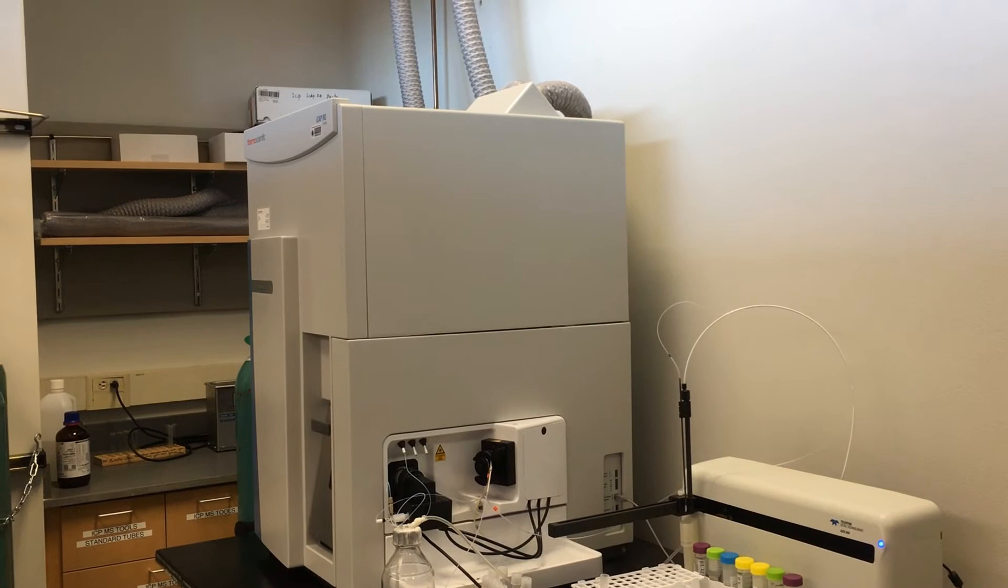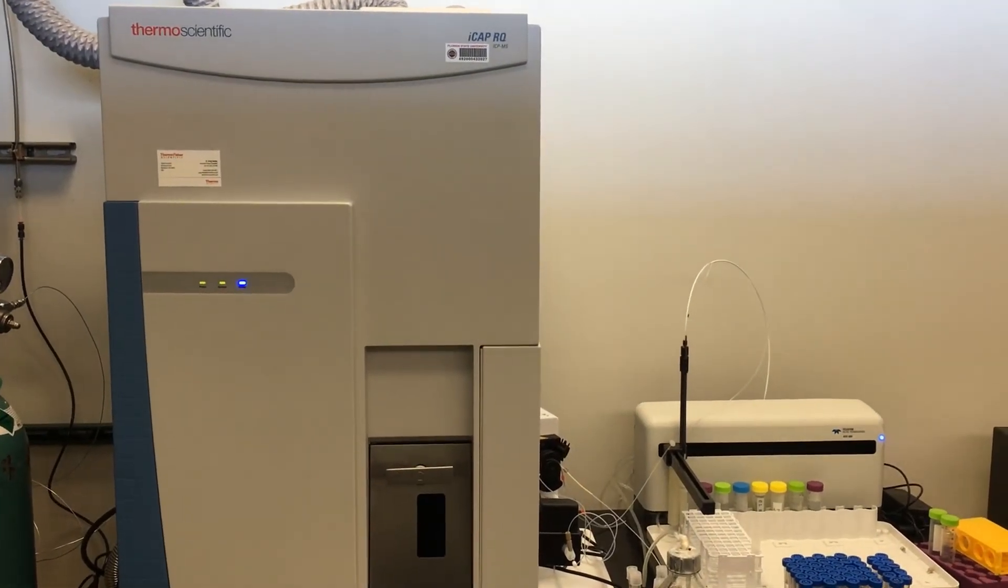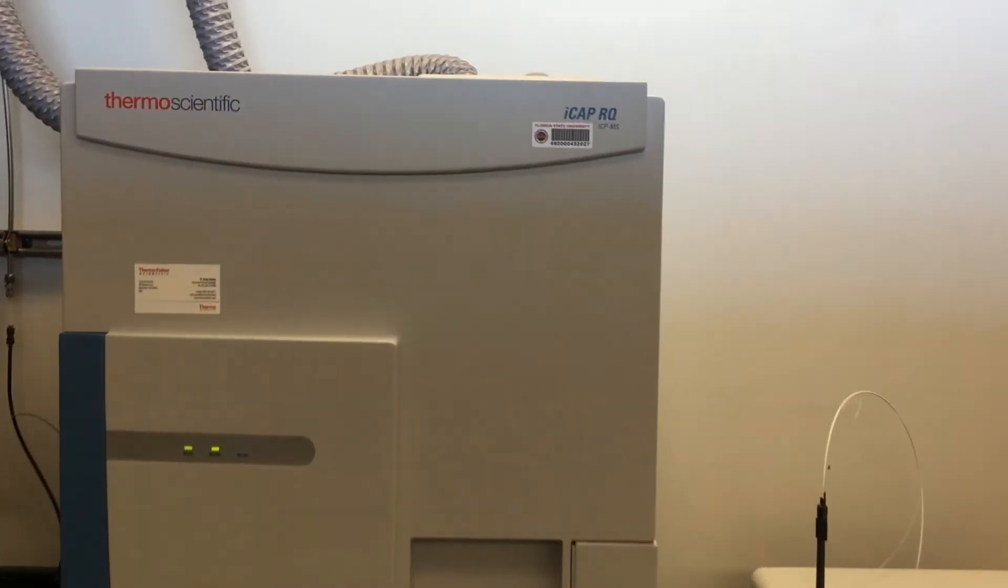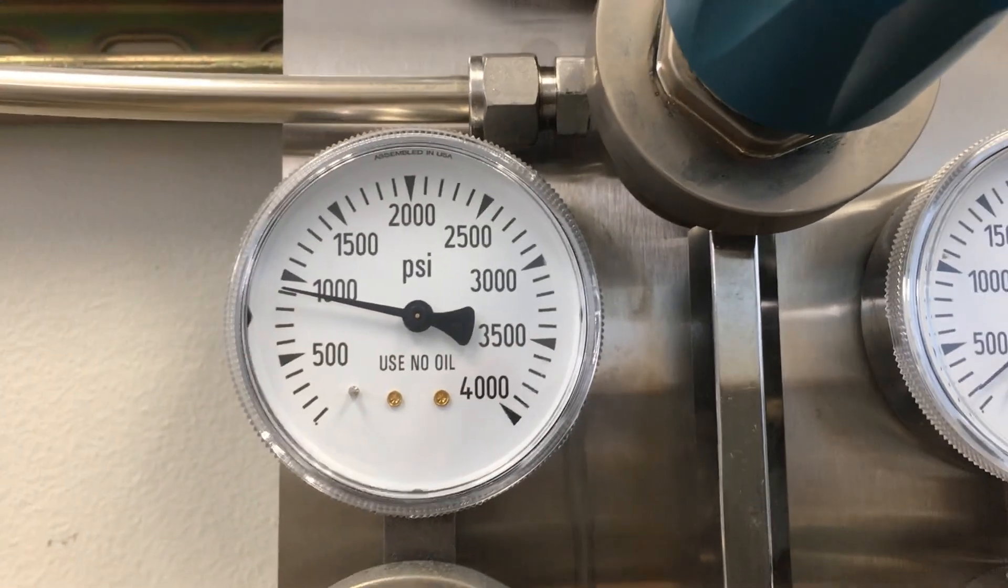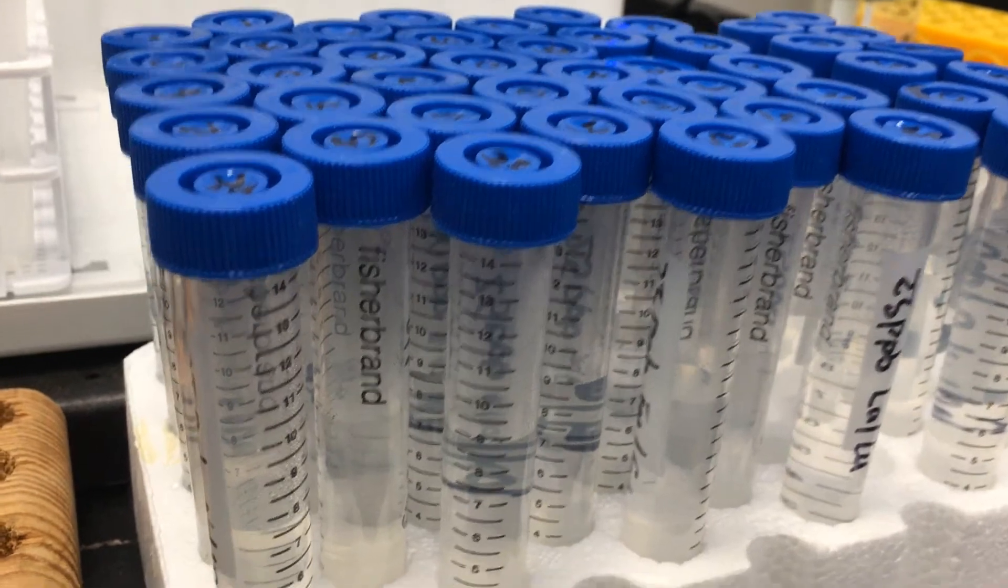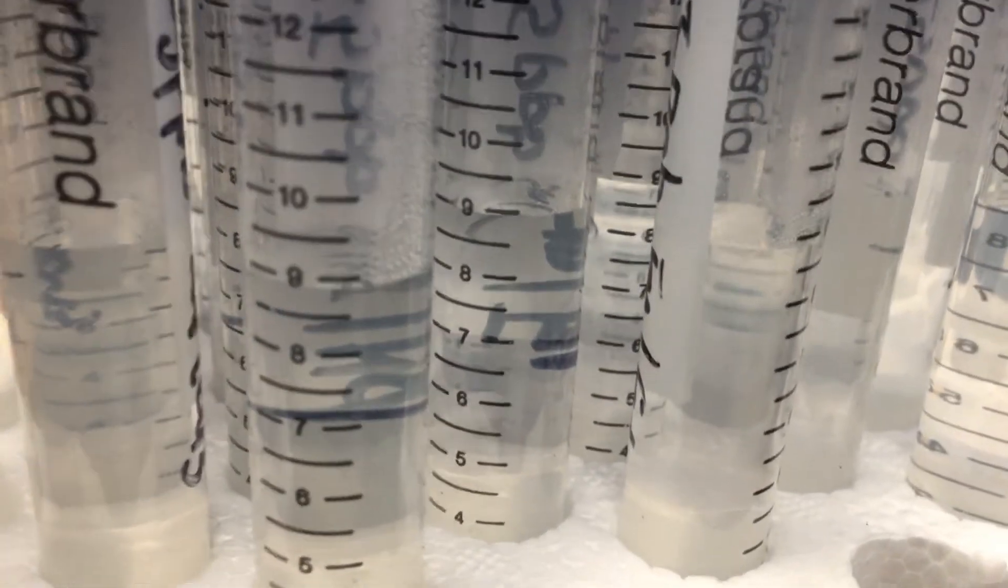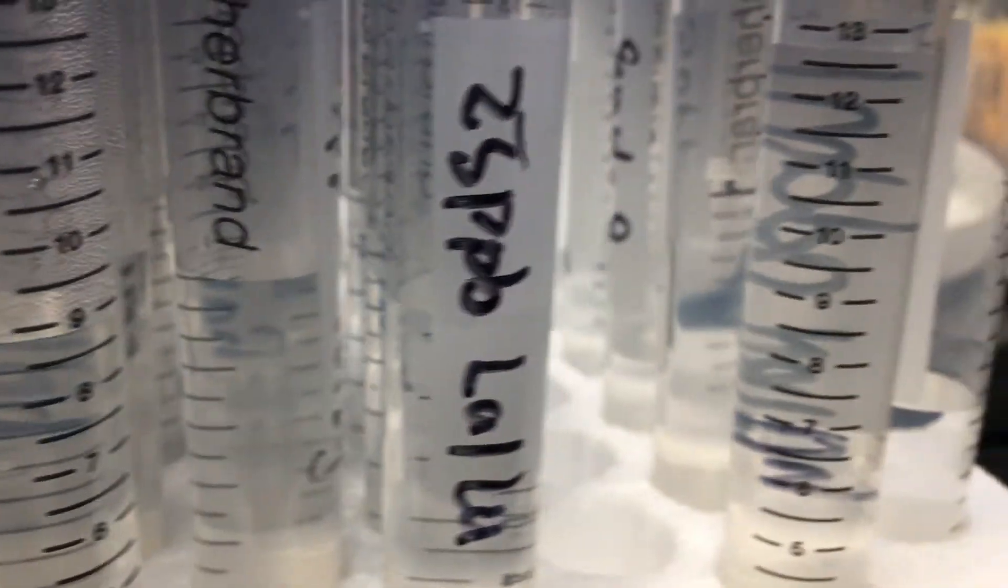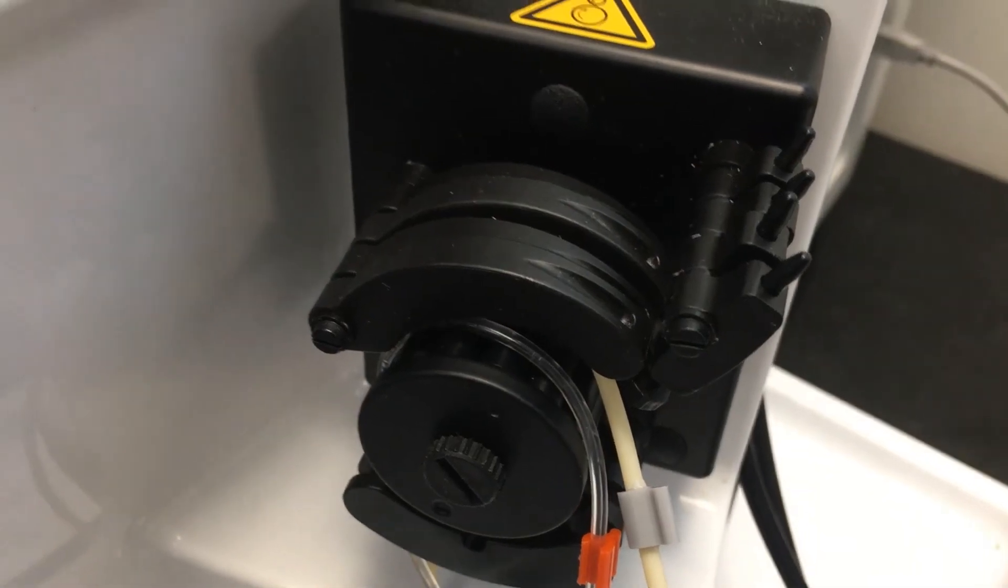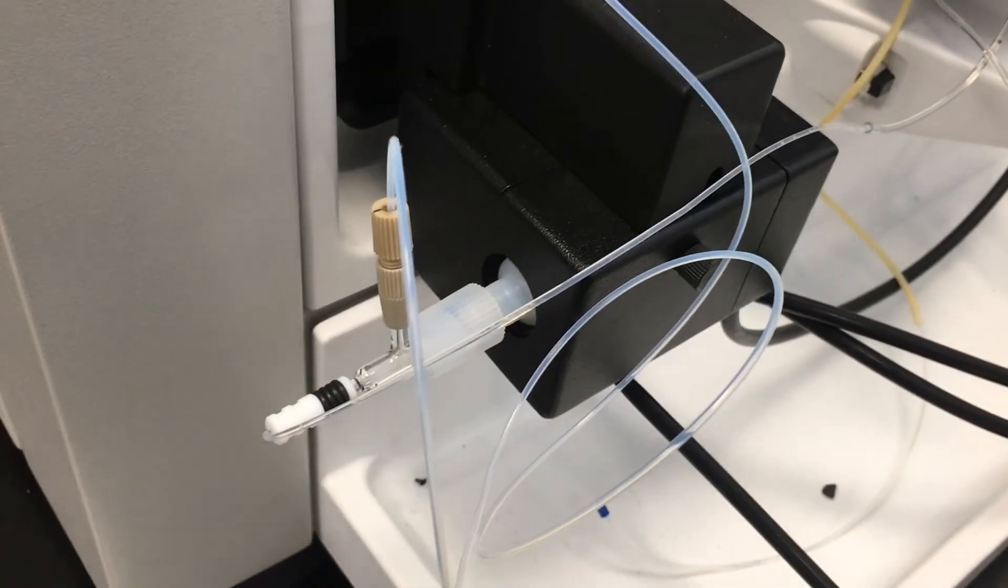Inductively coupled plasma mass spectrometry (ICP-MS) is an elemental analysis technology capable of detecting most of the periodic table of elements at milligram to nanogram levels per liter. It is used in a variety of industries including, but not limited to, environmental monitoring, geochemical analysis, metallurgy, pharmaceutical analysis, and clinical research.